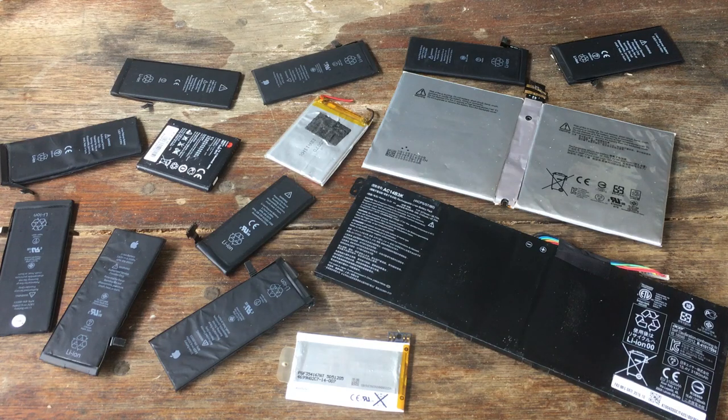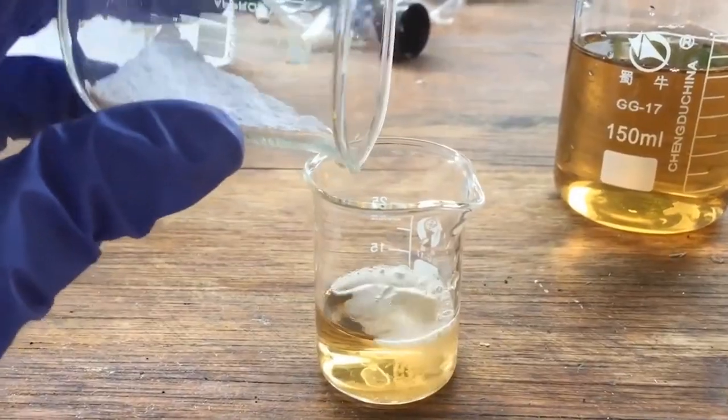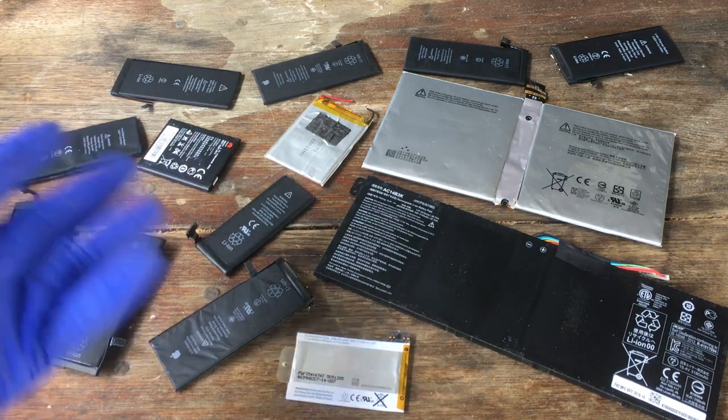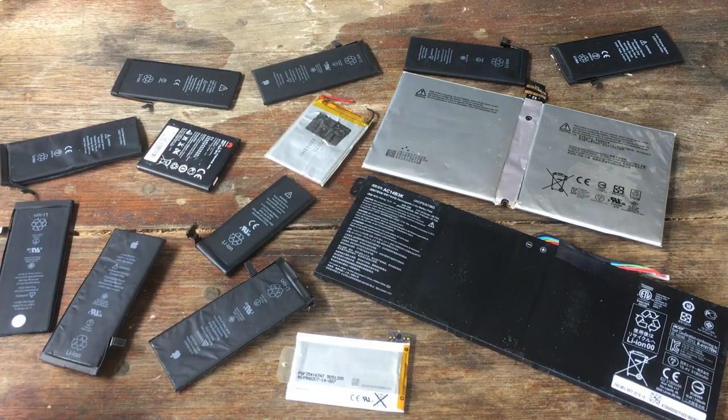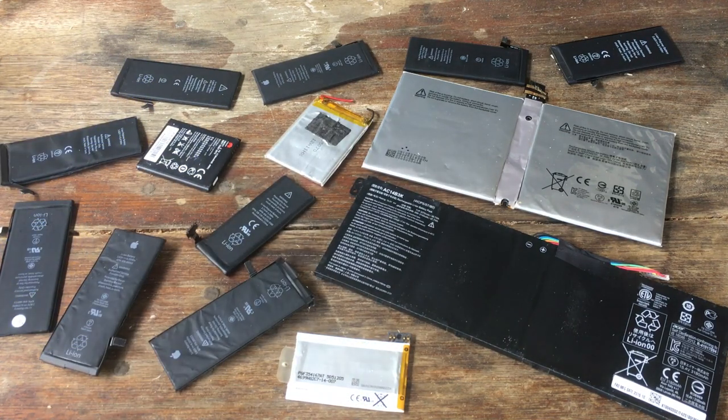Hi guys, Harry here. Welcome to Scrap Science. Long story short, I have a lot of lithium-ion batteries here, and I would like to extract the lithium from them.